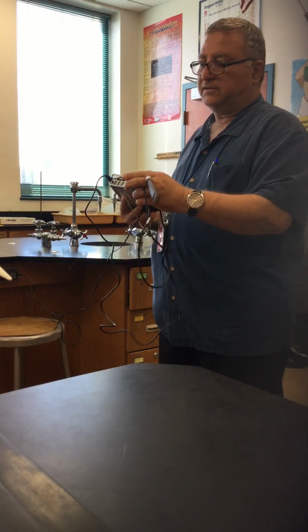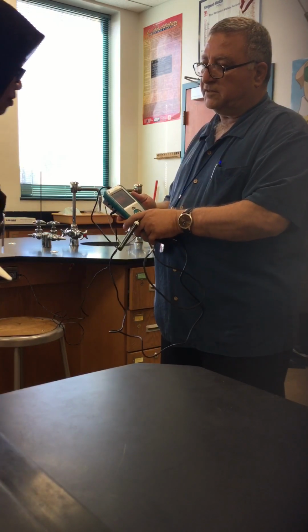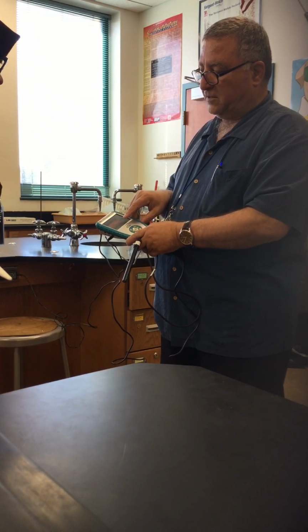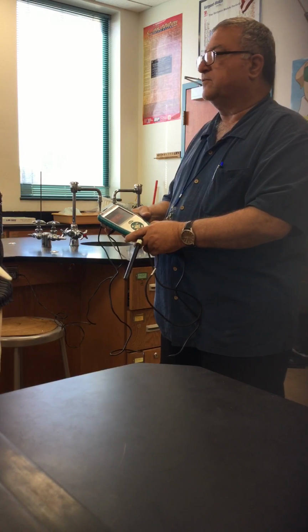This is a conductivity electrode connected to channel 1, and it's automatic sensing. It senses the electrode automatically, and it's giving you the reading in microsiemens per centimeter, which is the unit for conductivity.